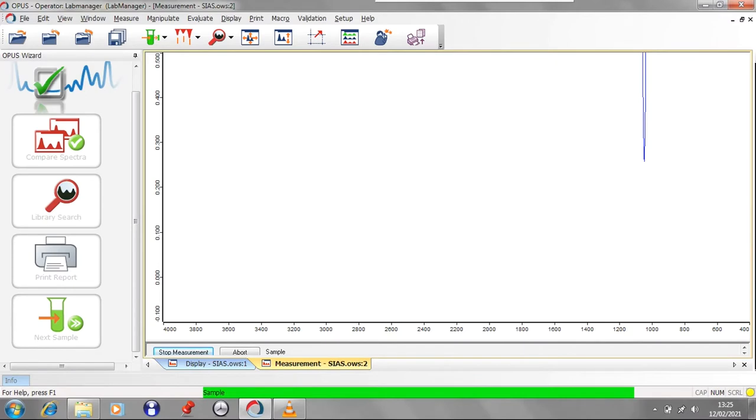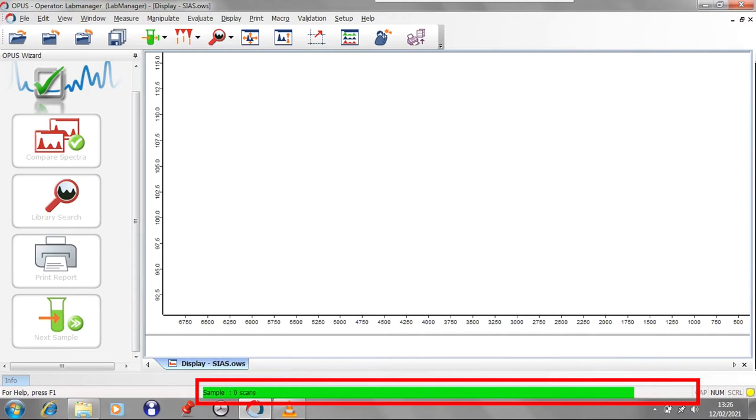As before, the progress bar at the bottom of the window will show you the percentage of scans complete.